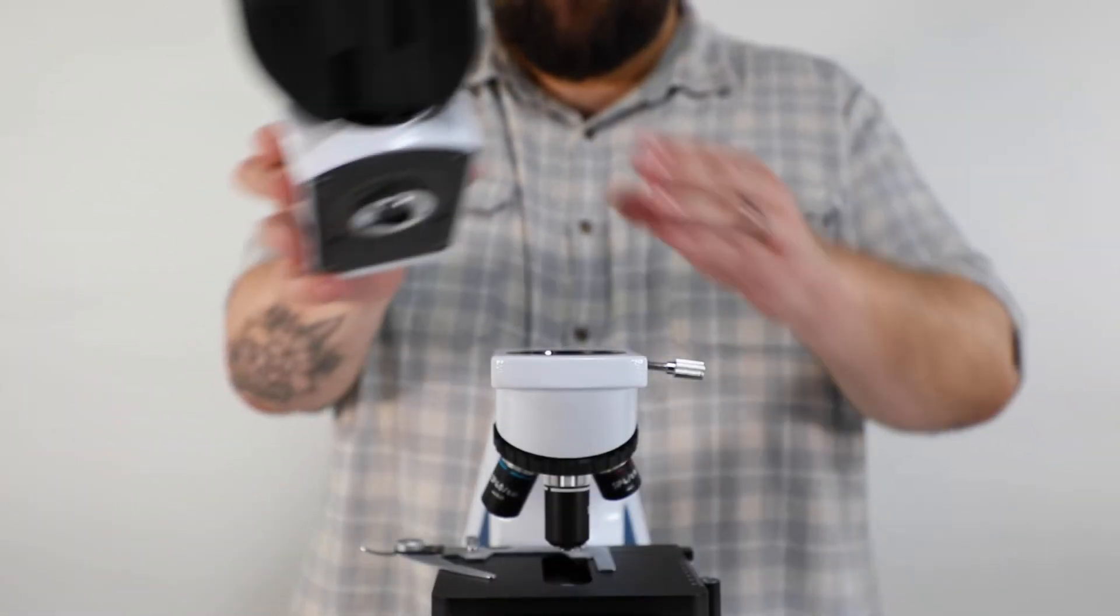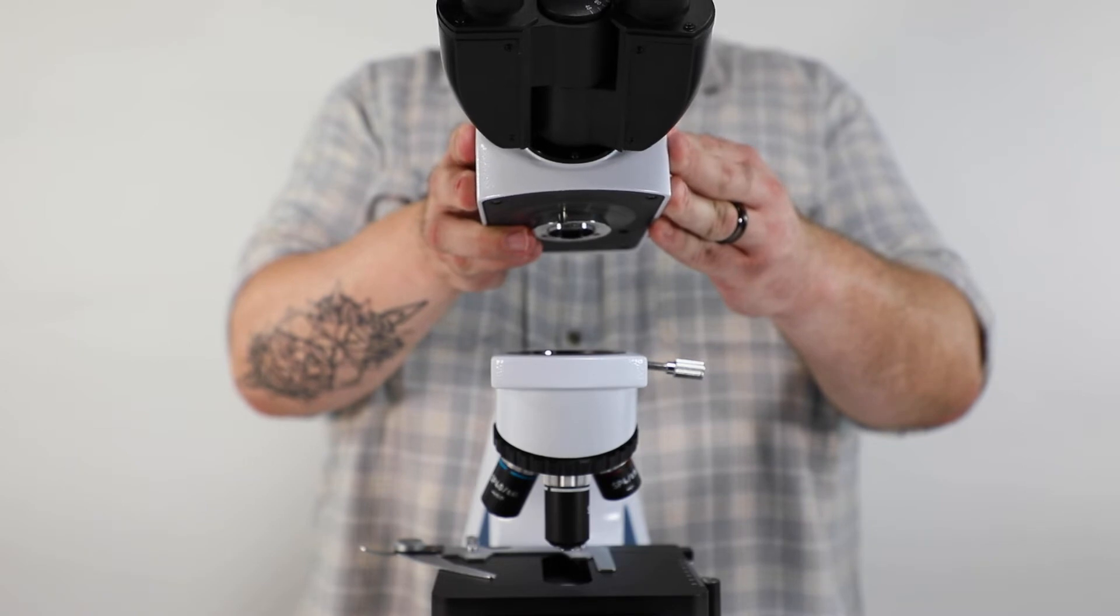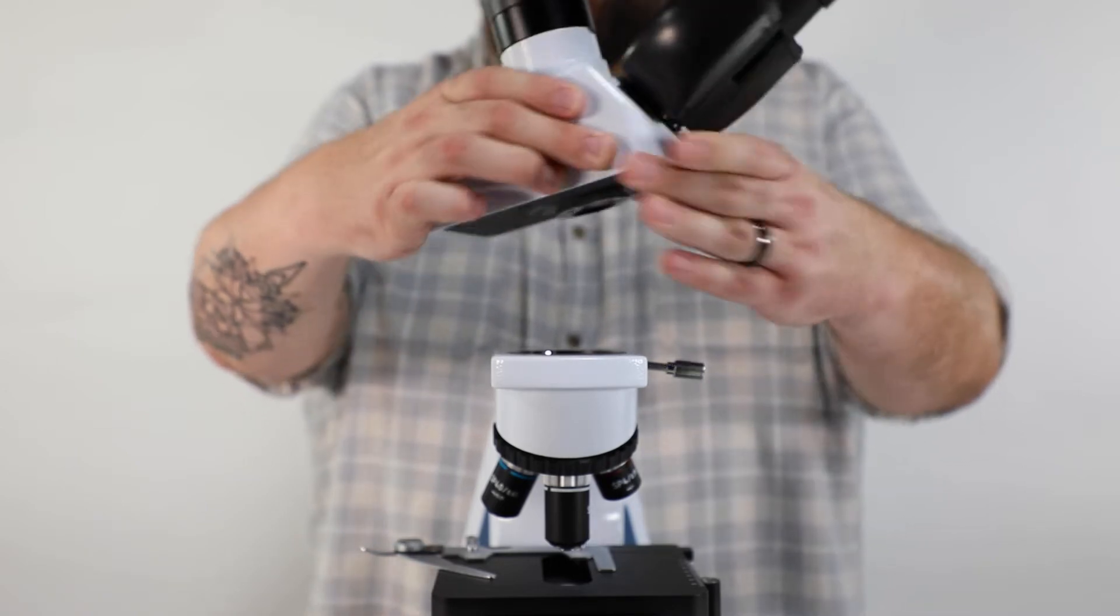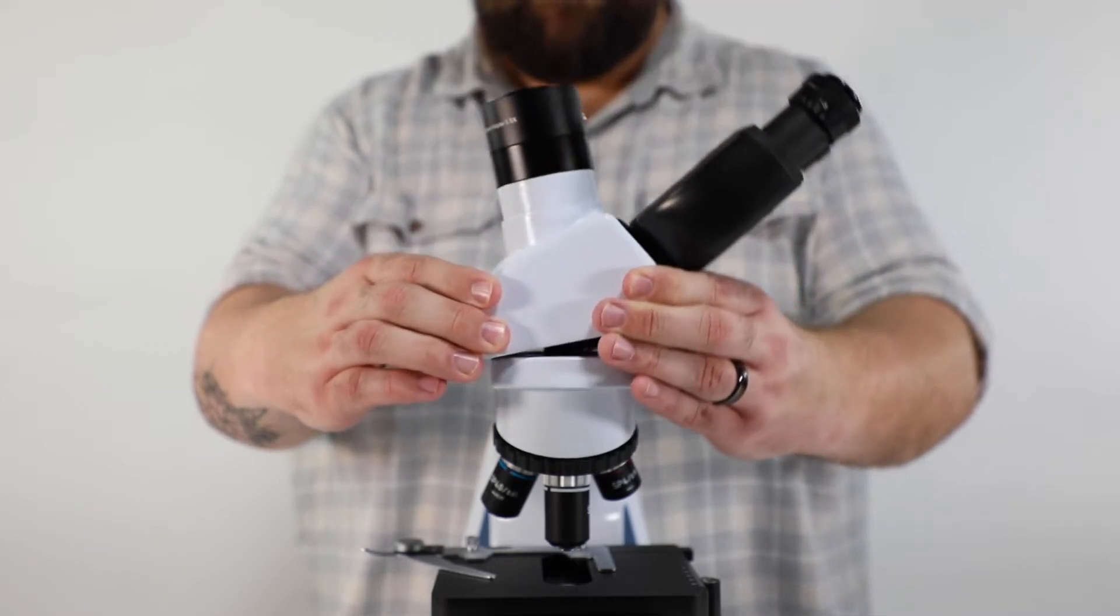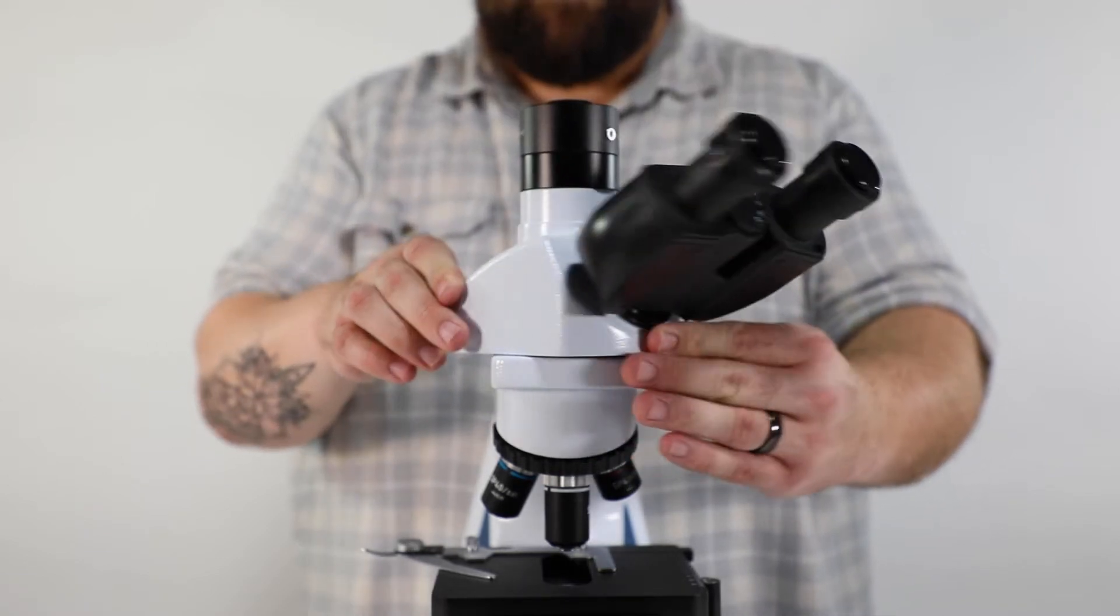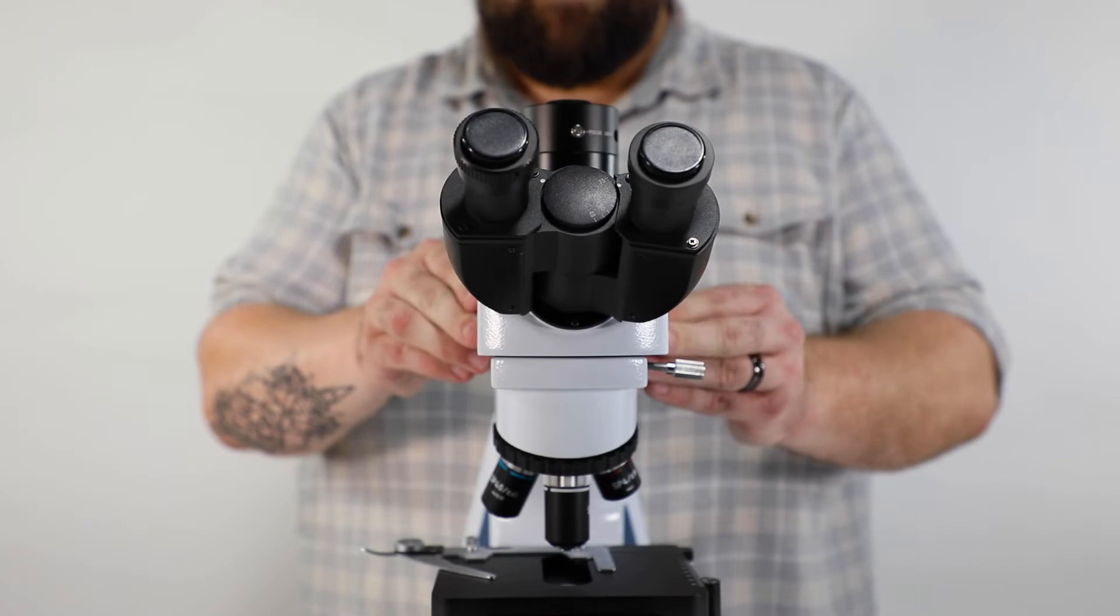Hold the microscope head over the body of the microscope with the eyepiece slots facing you. Then turn the microscope head about 90 degrees to the right and slightly tilt the head back so that the eyepiece slots are angled up. Lower the head into the port, making sure that the notch in the port is flush with the space on the bottom of the head.